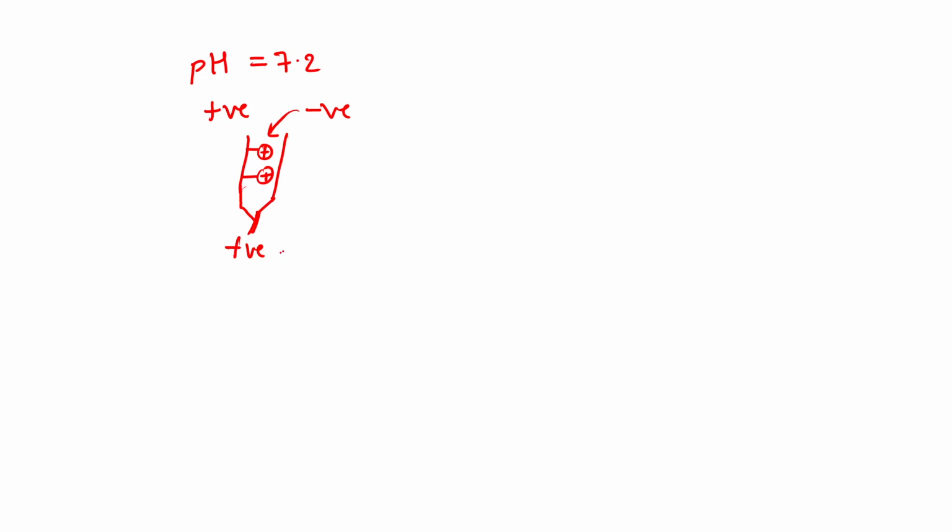Now, let's say my protein of interest is positively charged. So, what will I do? I will take the first elution, the starting elution that has not interacted with the column at all, and load it in a cation exchange column. Cation exchange will have a negatively charged matrix, and the mixture of different positively charged proteins will be loaded, and based on the solubility and the interaction, my protein will elute out at a particular time point.